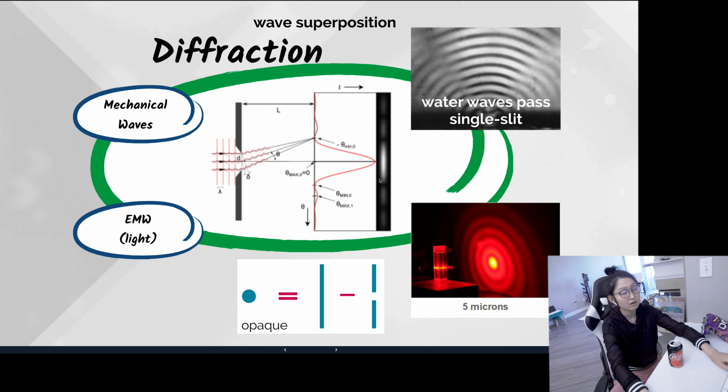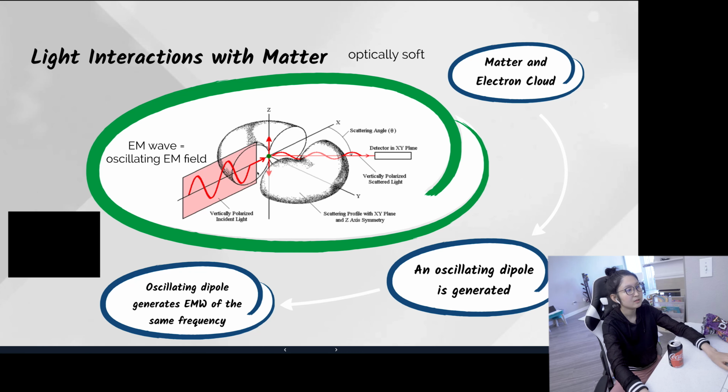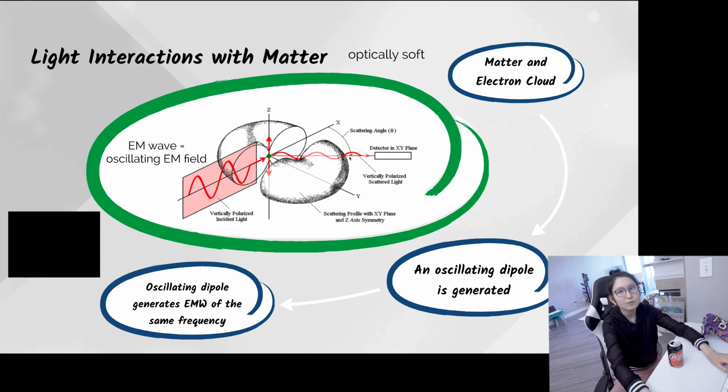Okay, light diffraction. Then light scattering is the opposite, because light needs to propagate through this particle and interact with its electron cloud, and then this electron cloud generates an internal oscillating field, which becomes the scattered light. Of course, it gets out at a different angle. What angle is it? That's what we're going to go through today.